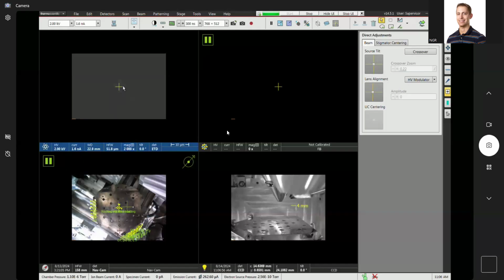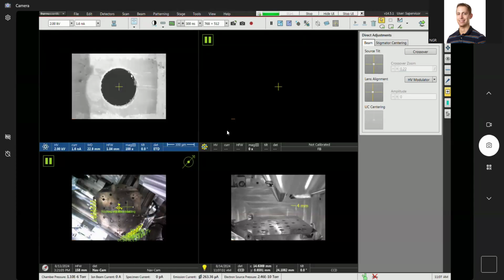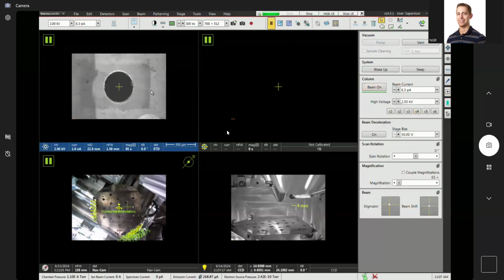So what I'm going to do to resolve this, there are escalating things you can do when you have something like this. One thing we could do is turn off the beam here and try just stopping and starting the UI.